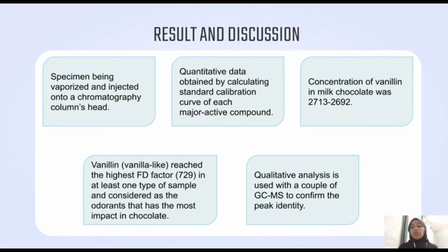Last but not least is qualitative analysis, which is used with gas chromatography mass spectrometry to confirm the peak identity.